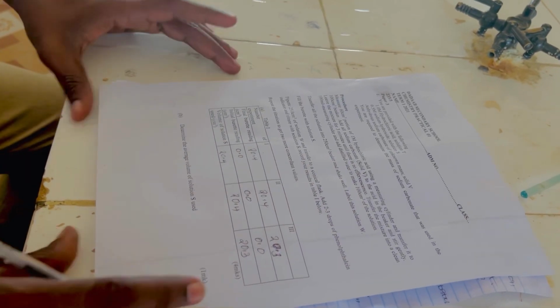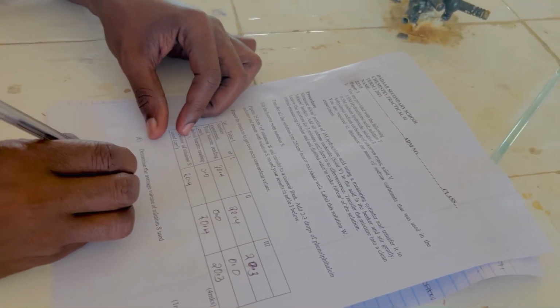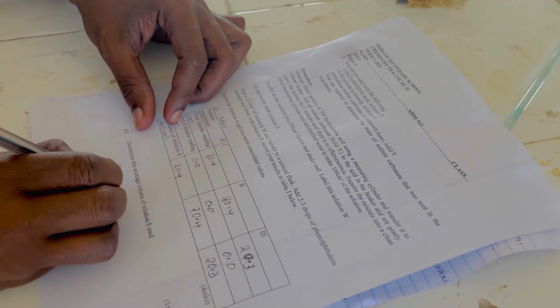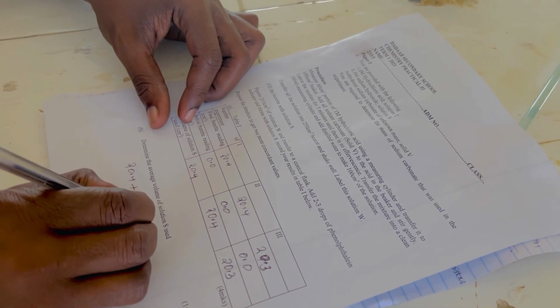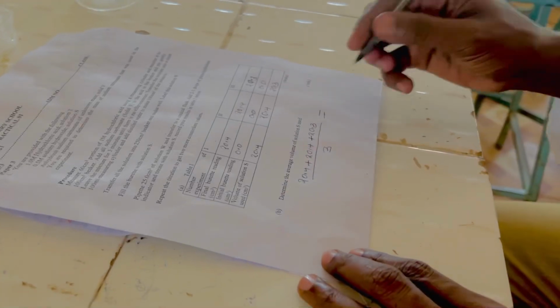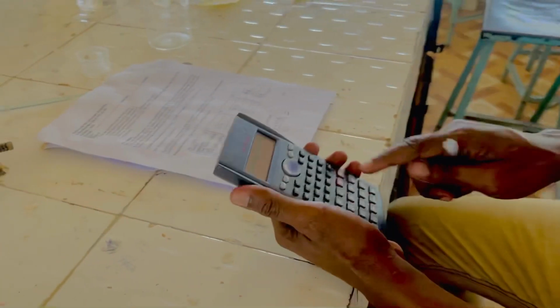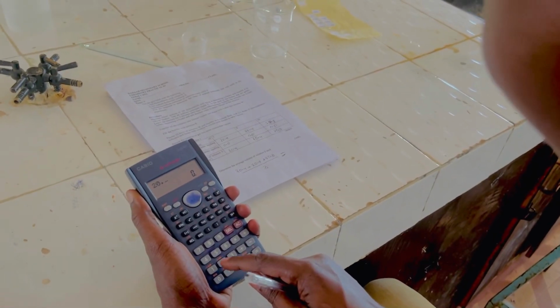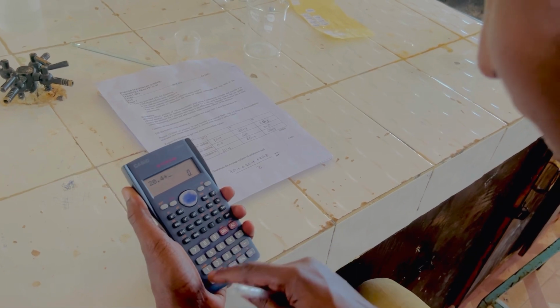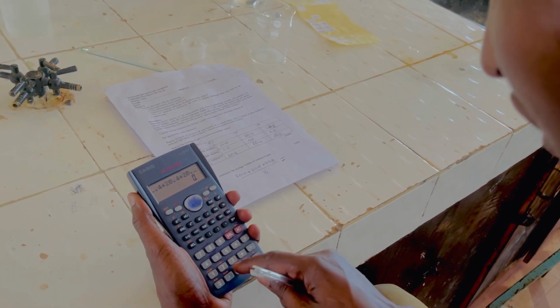So now I will calculate my average titer. I will add 20.4 plus 20.4 plus 20.3.